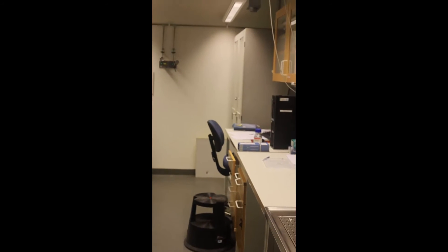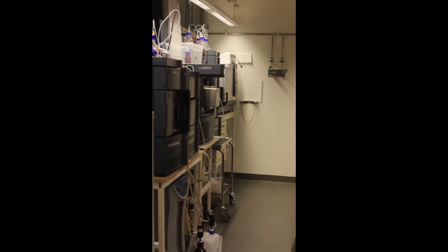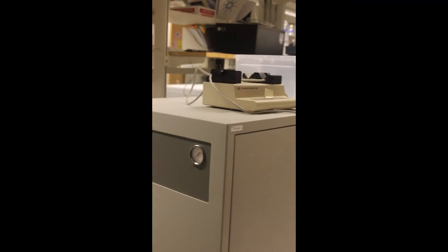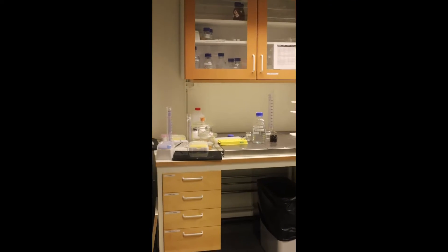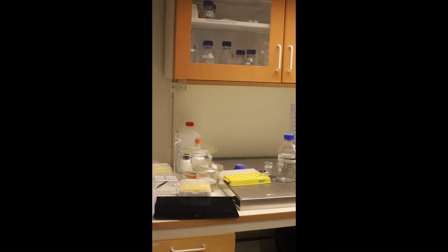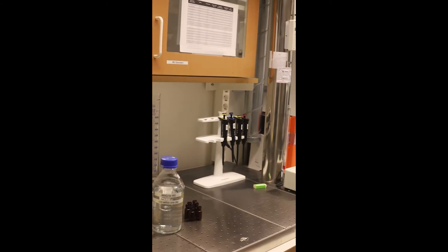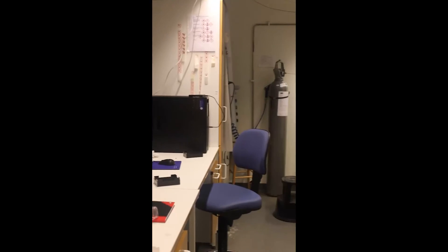Here is the second lab that mainly analytical chemists work in this lab. In this lab, we have advanced instruments such as triple quad from Agilent and LC-MS from Waters.